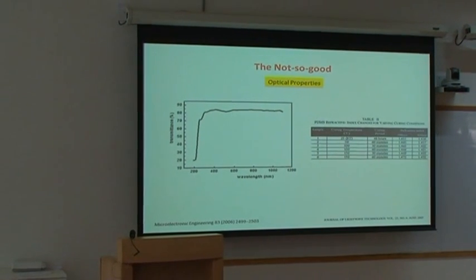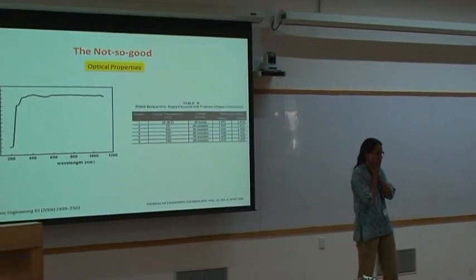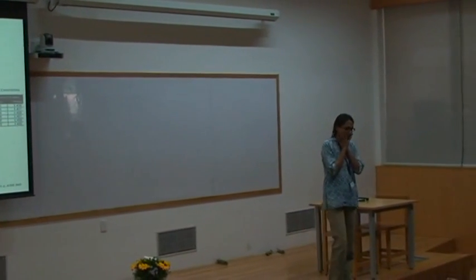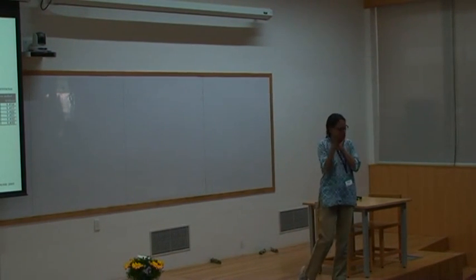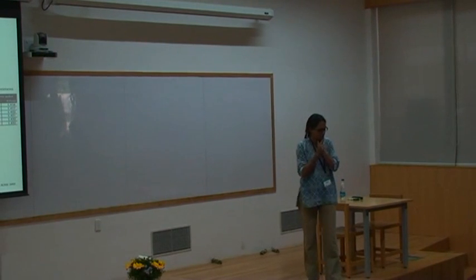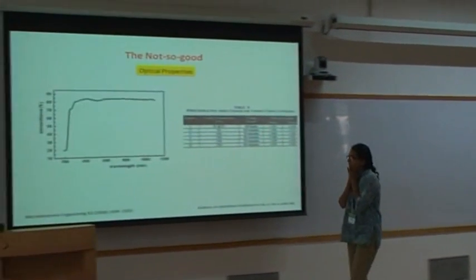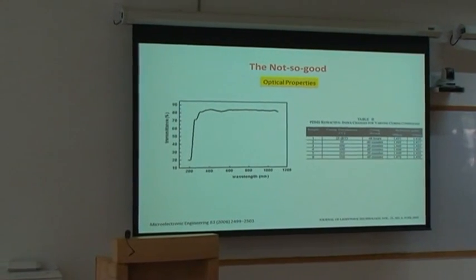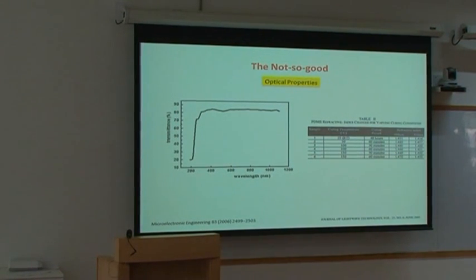But this is at what? This is at 100? I have to check. This is much more than 100. So we have not characterized it. I think that's one thing that one can do: taking glasses, using glasses, transmittance, use a different thickness of PDMS and see what the difference is in the transmission. Yeah, so it's pretty bad. It is bad. I don't know how thick this is, it could be around a mm. So yeah, this is pretty bad.